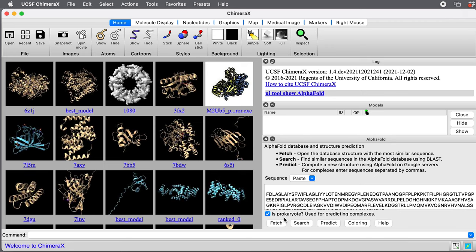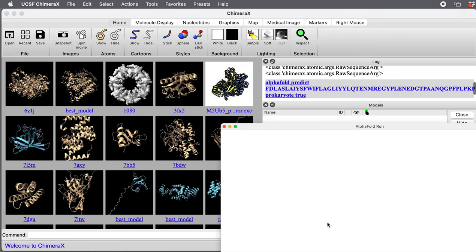For prokaryotes, the genes of a complex are often right next to each other on the genome. This prokaryote switch lets AlphaFold take advantage of that to find sequences of the three proteins. So I press predict.